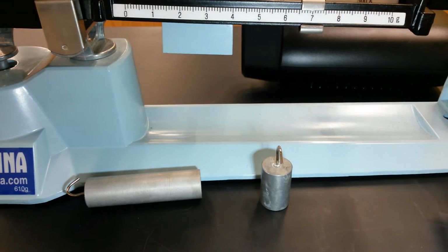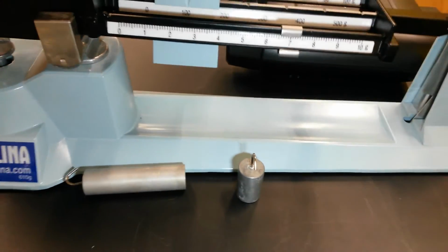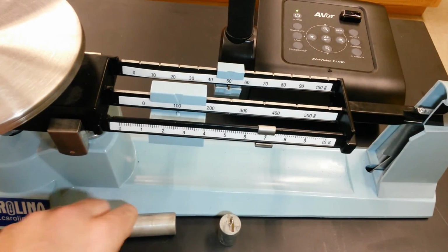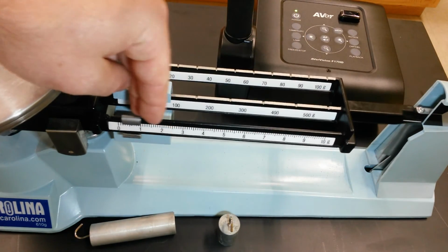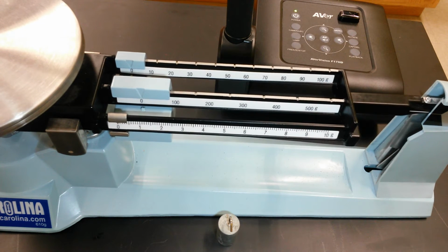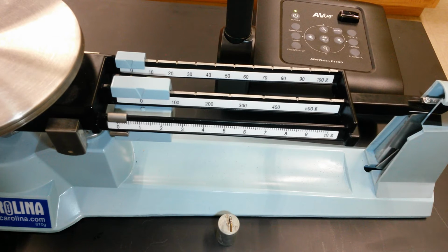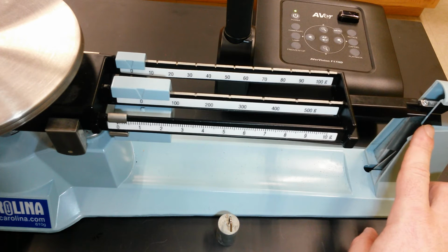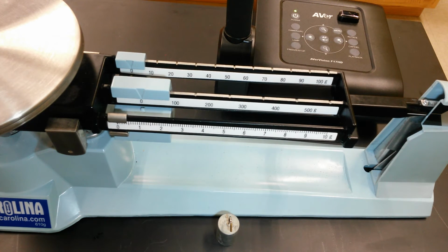Next will be our measurement of mass. For mass, you will either have a digital scale or you'll have a triple beam balance, which is what you're looking at right now. First, to find the mass, I'll set them all to 0. Okay, and if your triple beam balance is set, it should balance over here at 0. Okay, and right now it looks pretty good. It's hovering back and forth, but that means it's pretty well set.